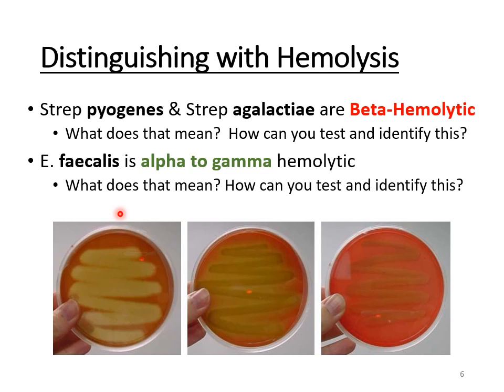E. faecalis on a blood agar plate would instead look like either of these two, okay? Because depending on the exact strain of E. faecalis you're dealing with, there'll be little to no hemolytic activity, okay? So make sure you're comfortable with understanding what hemolytic activity is, what test you would do for it, how you would set up that test, and what the results would tell you.